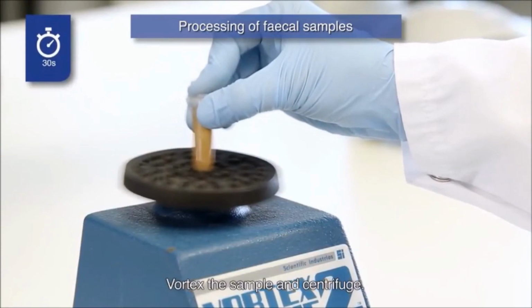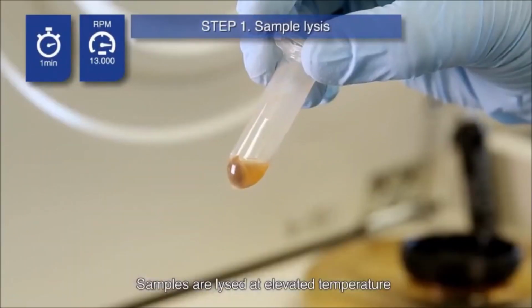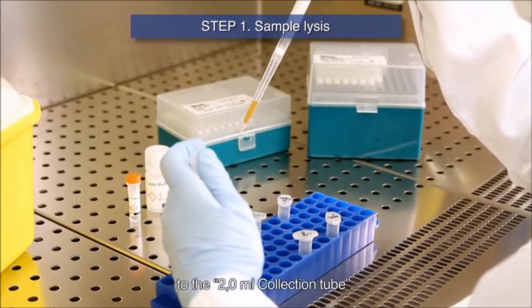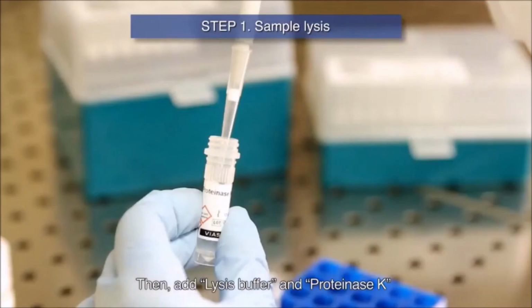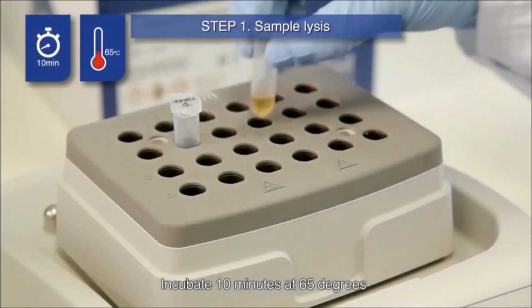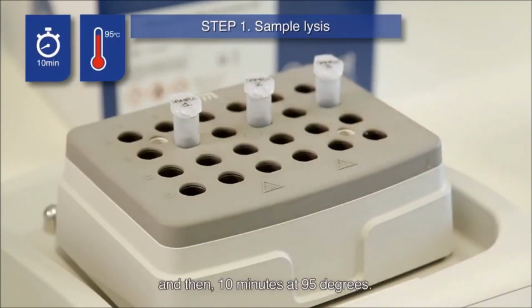Vortex the sample and centrifuge. Samples are lysed at elevated temperature in the presence of lysis buffer and proteinase K. Transfer the supernatant to the 2.0 ml collection tube. Then add lysis buffer and proteinase K and vortex vigorously. Incubate 10 minutes at 65 degrees and then 10 minutes at 95 degrees.